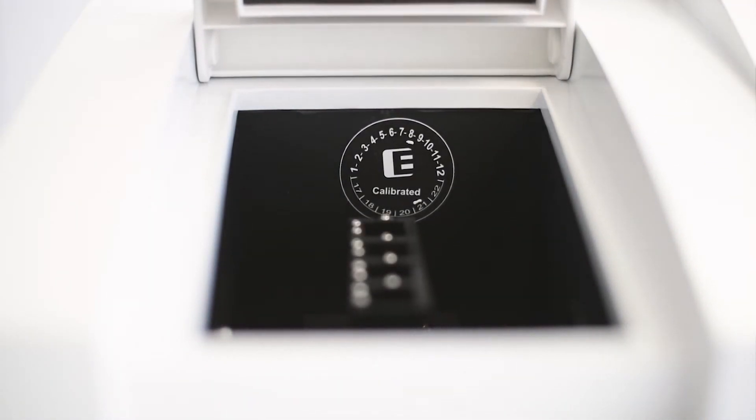Also you can find a calibration sticker which is inside the sample compartment. This is important so you can check when the instrument was last calibrated, and you can calibrate the instrument yourself afterwards.